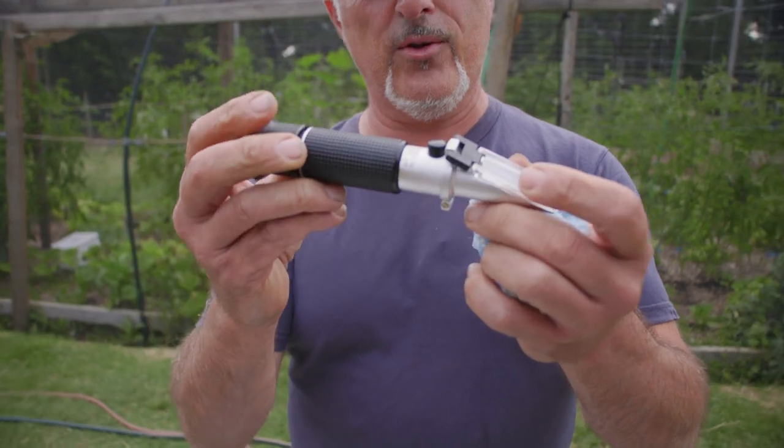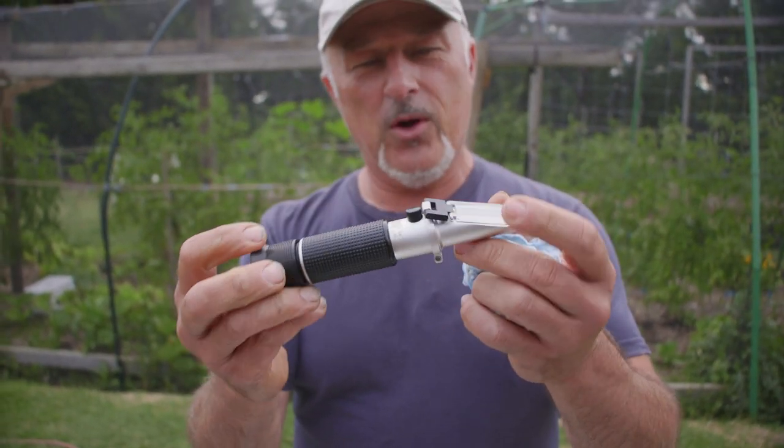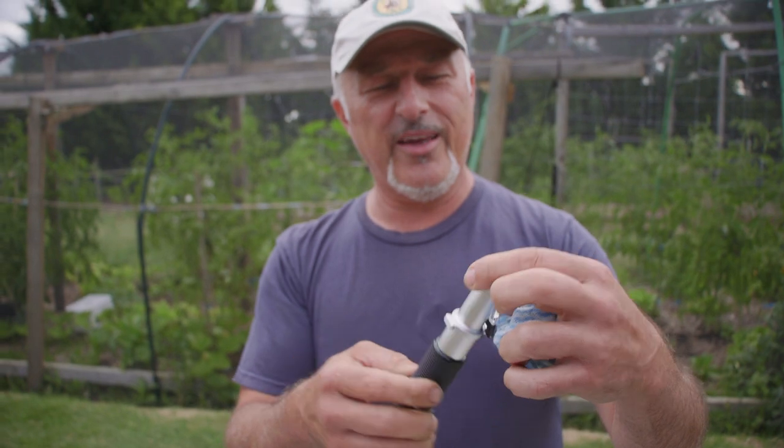I did a live feed earlier on this little tool here. This is called a refractometer, whichever way you want to say it.